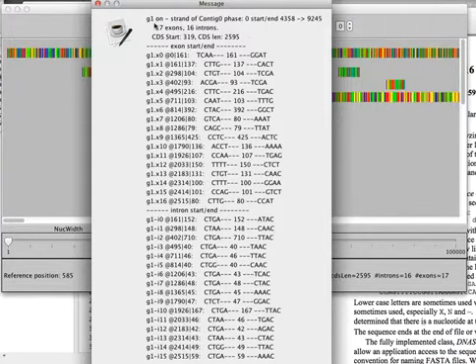This gene within the contig starts at position 4358 and goes to 9245. The gene has 17 exons and 16 introns, and the coding sequence starts at position 319 within the gene, and it's 2595 long.